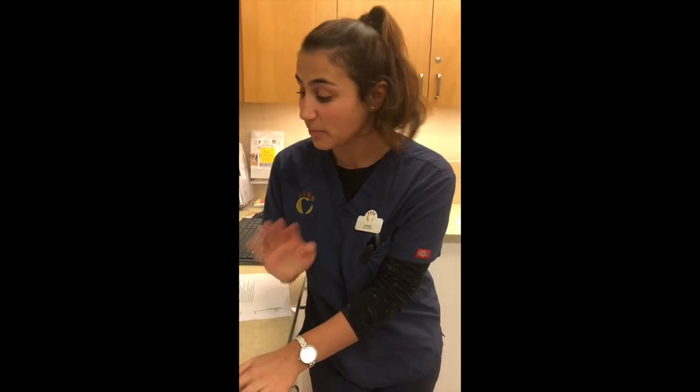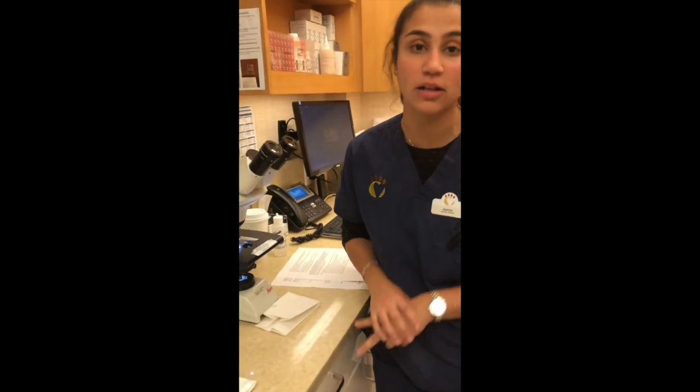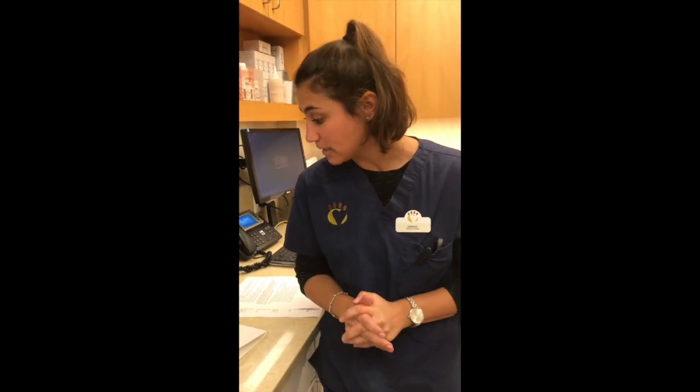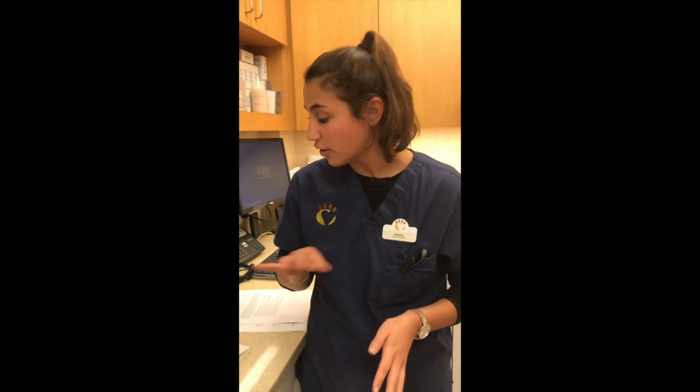Okay, so I'm looking at our vaginal cytology now, and what I see is quite a large number of non-cornified squamous epithelial cells. So that means that our dog is in anestrus. She's not in heat, and she's currently not attracting any other dogs. In the epithelial cells, the nucleus is very, very small, and the corners are very rounded. Therefore, they're not cornified.